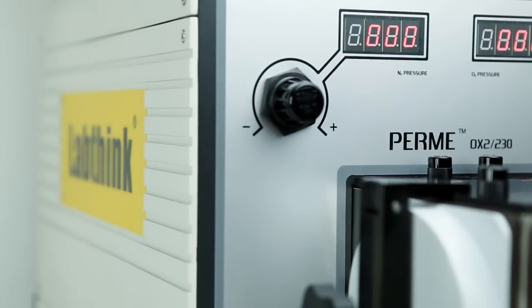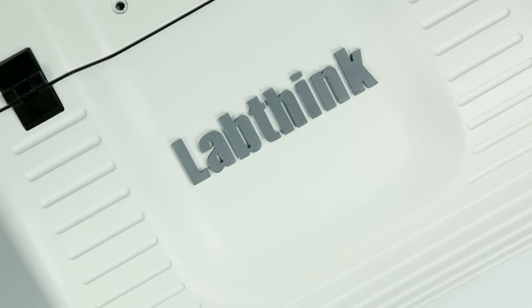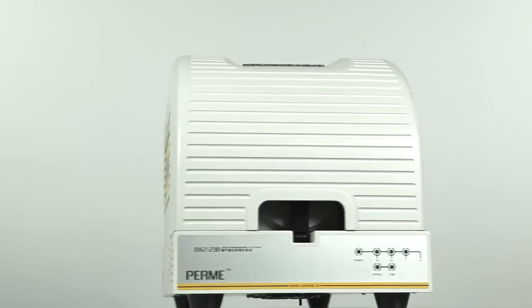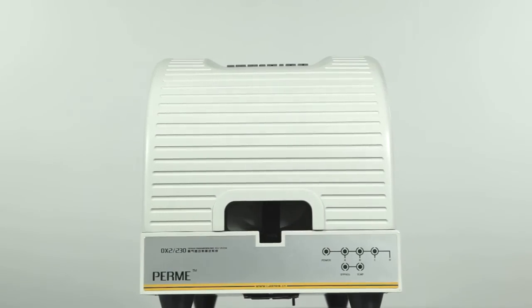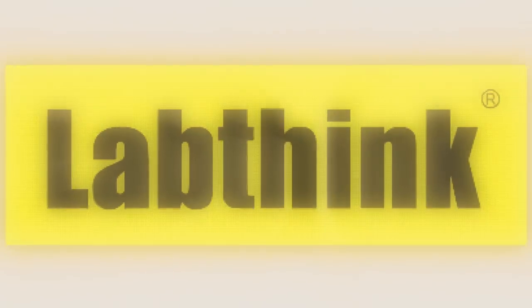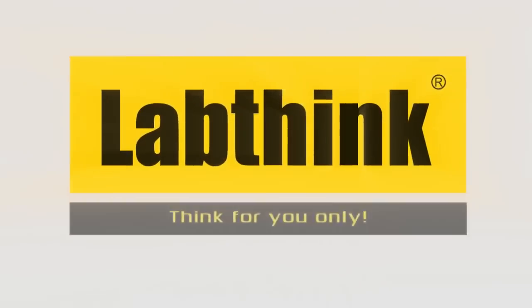OX2230. Your excellent choice for OTR testing system. LabThink. Think for you only.